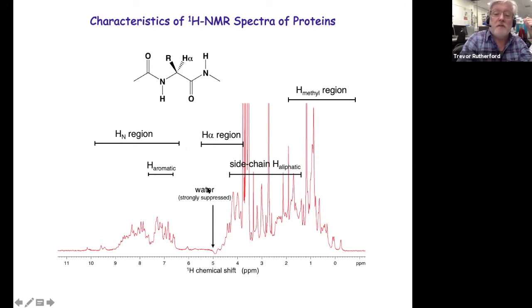I should also say that we need to take steps to suppress the water signal, because water is there at 55 molar, so 110 molar water protons, and we have proteins that are generally there at something like 500 micromolar at a maximum.